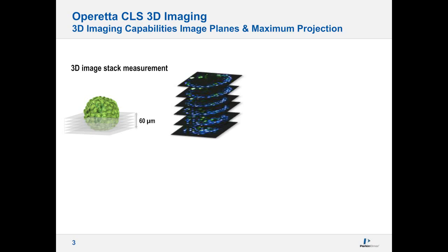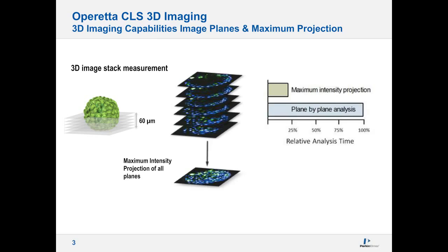There are two ways to do three-dimensional measurements. We can either take the stack, or we can collapse the stack, and this forms a maximum projection intensity of all the planes together. This is a way for us to do a very fast measurement, and it does not take long. The maximum projection intensity collapsed images are a much faster way to analyze three-dimensional image stacks.